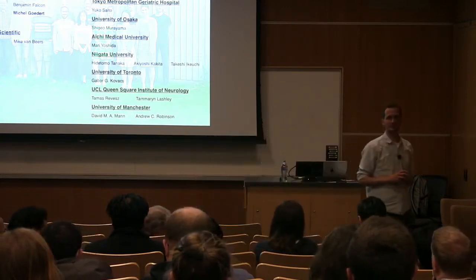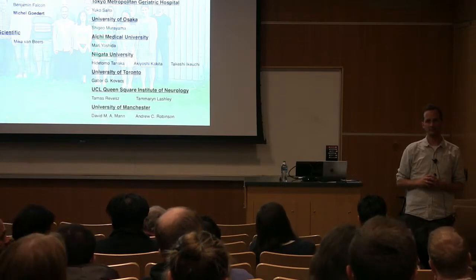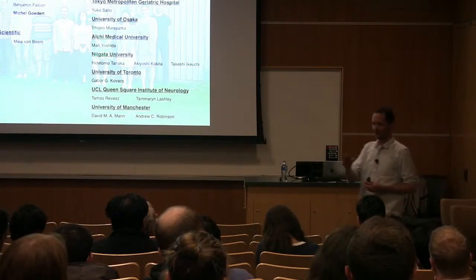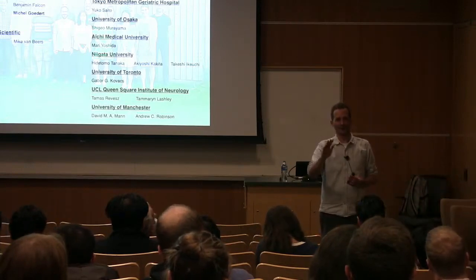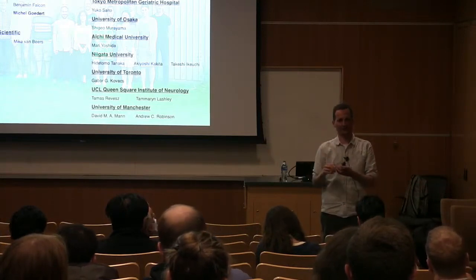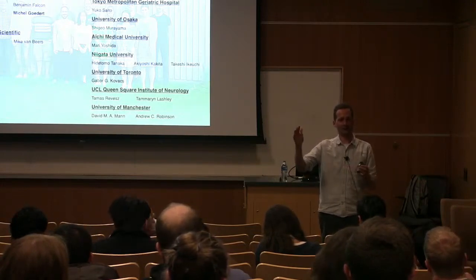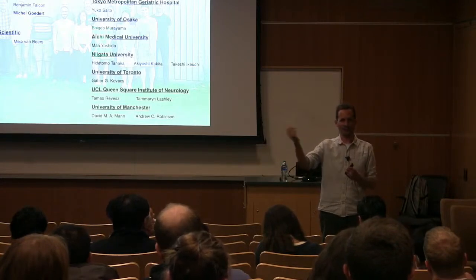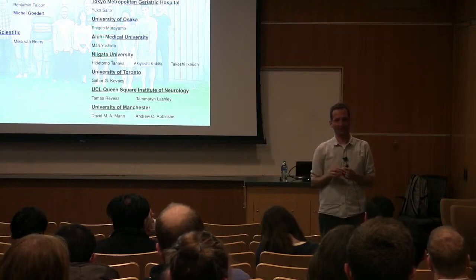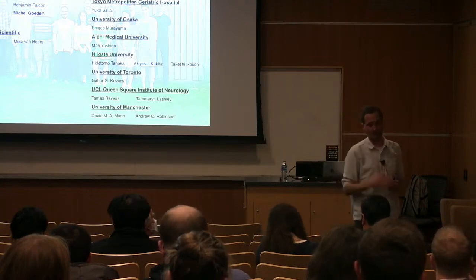Have you been able to get any information on structural heterogeneity along one filament? I'm particularly thinking of the ends, and whether the ends look like the middle. The type of averaging that we do precludes us from looking into that much, because the averaging assumes that each of these layers is exactly the same. To study the structure at the end, you would have to let go of helical symmetry, and the number of particles would tumble dramatically, because then each end is unique. We haven't really tried to do that, but one could in principle try.